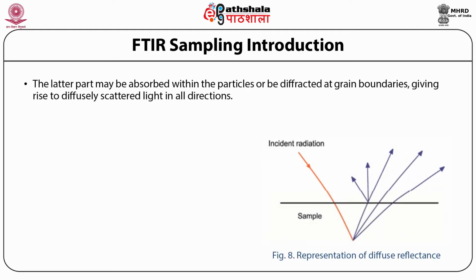The latter part may be absorbed within the particles or be diffracted at grain boundaries, giving rise to diffusely scattered light in all directions.